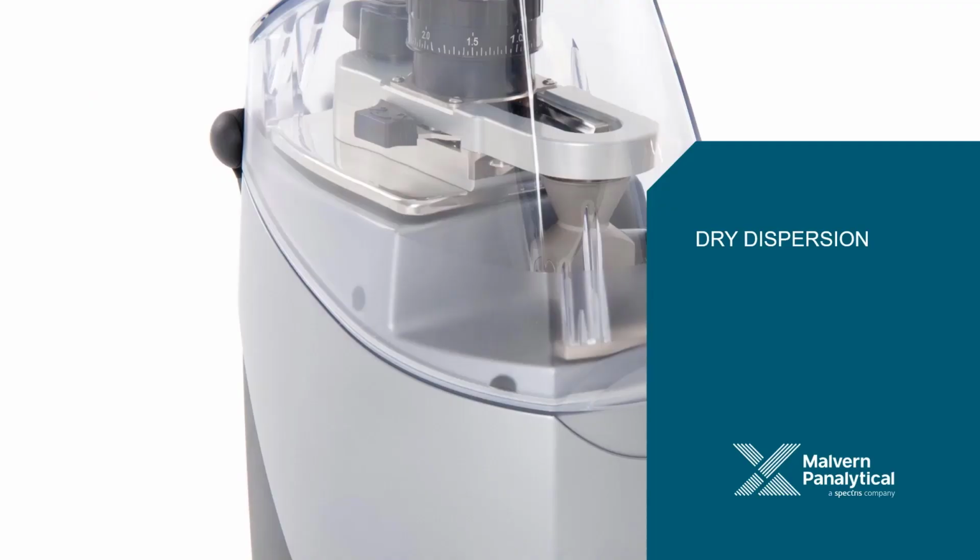Let's continue with dry dispersion analysis with the Mastersizer 3000. Do not forget, only dry materials can be tested using dry dispersion analysis. If the material is slightly wet, you will need to measure it wet dispersed.